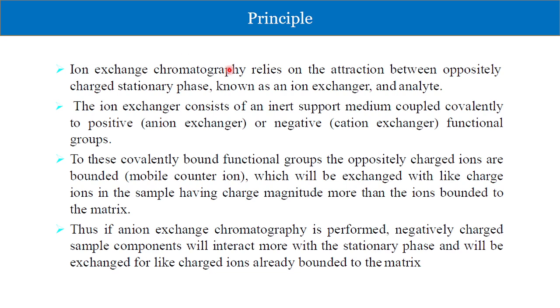So the basic principle behind this chromatography entirely relies upon the attraction between the oppositely charged stationary phase, known as the ion exchanger, and the analyte. Now the ion exchanger consists of an inert support medium covalently linked to an anion exchanger or a cation exchanger, depending on what type of separation you want to do, what type of charge your protein has and all. Now, to these covalently bound functional groups, the oppositely charged ions are bound, which is the mobile counterion, exchanged with the like charge ions in the sample having charge magnitude more than the ions bound to the matrix.